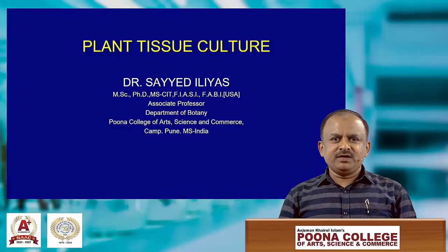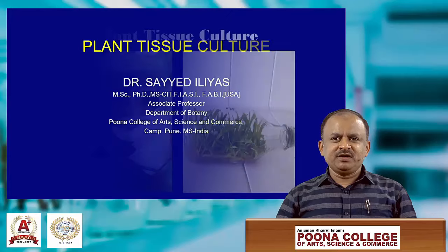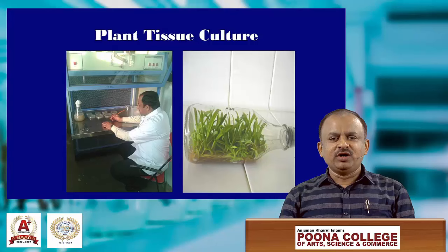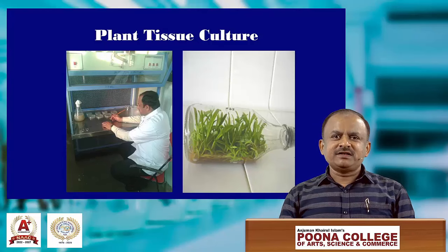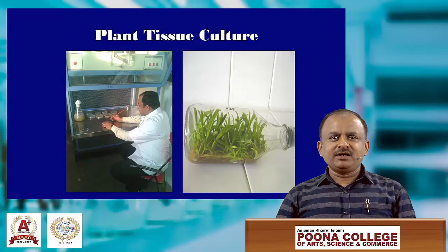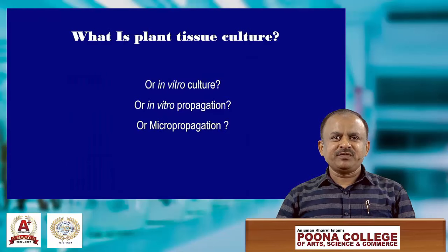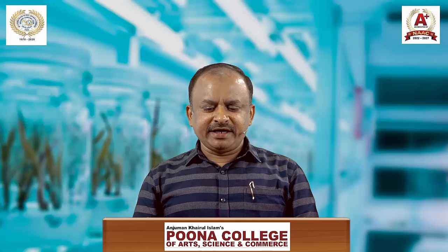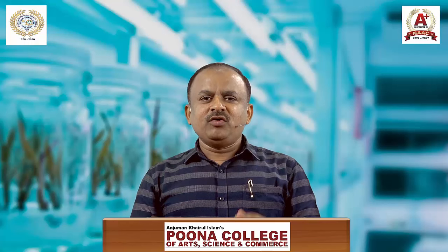Hi students, in today's lecture we will discuss in detail plant tissue culture techniques. Whatever the findings in our laboratory regarding plant tissue culture, we will discuss in detail the different techniques and what precautions we have to take while performing plant tissue culture, while getting plant tissue culture plantlets in the laboratory.